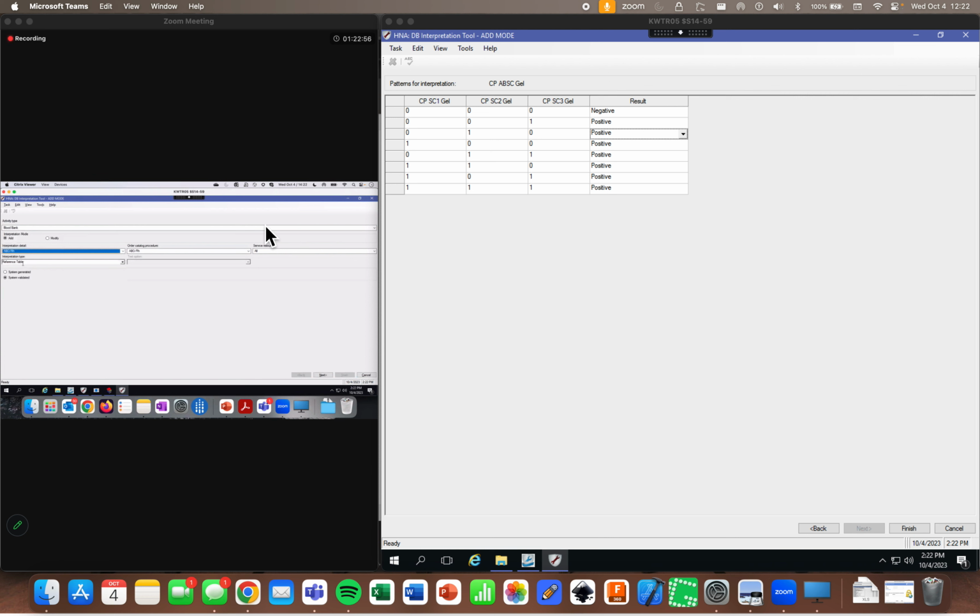Okay. Yep. So we do it that way so that, in the very unlikely event that our blood types were to ever change, it still updates that reference table and we don't have to worry about going back and messing with alpha responses. But that would be very unlikely at this point. So it's just the way that the database has it stored as a separate table instead of like a code setter or something. But yeah, ABORH orders are special because of that. Alrighty, any other questions?